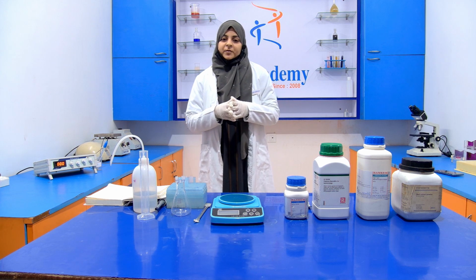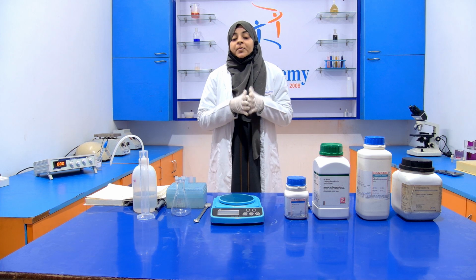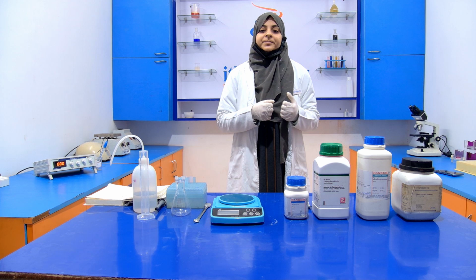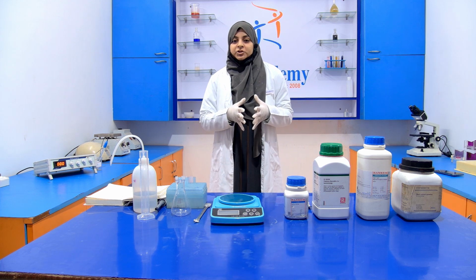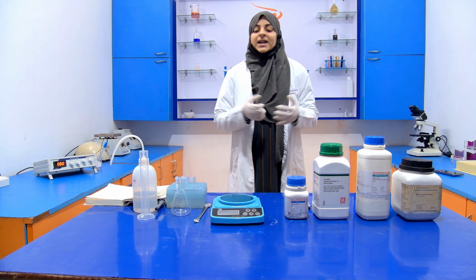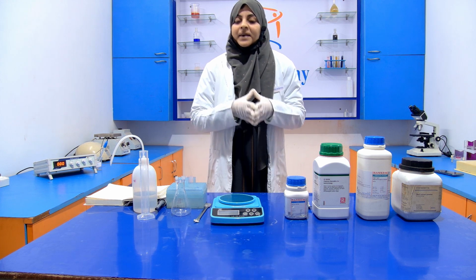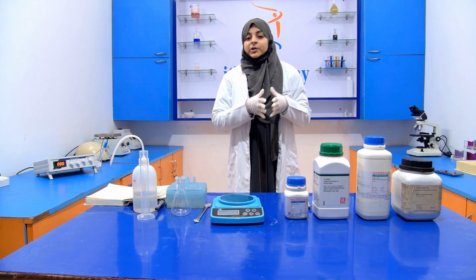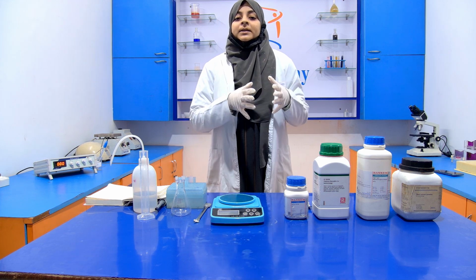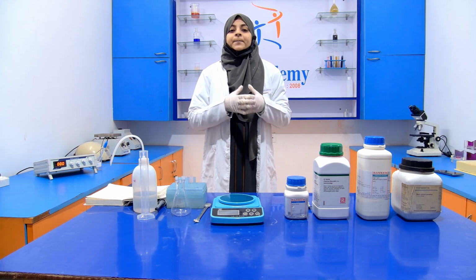Today we are going to perform the experiment that is your media preparation. So before starting the lecture, we have to know what is this culture media. Simply, a culture media is defined as any liquid or gel-like substance which is used for the growth of microorganisms like bacteria and fungi. So today the media that we are going to prepare is a nutrient agar media.